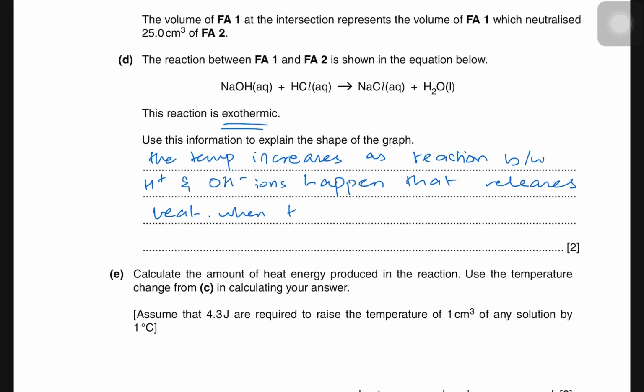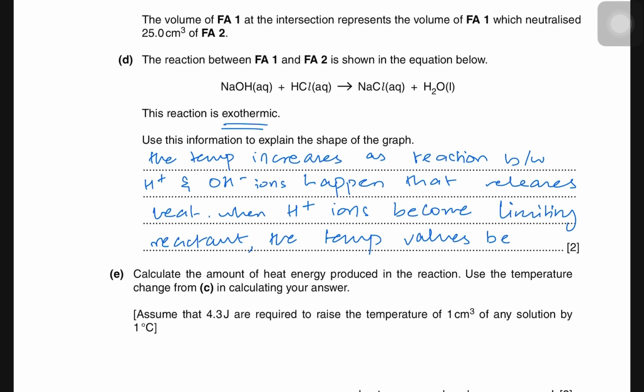When H plus ions become the limiting reactant, the temperature values become constant.